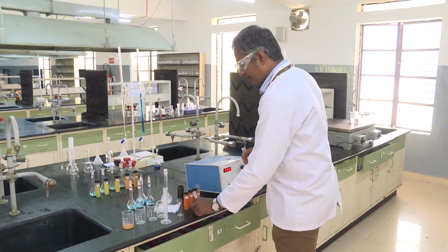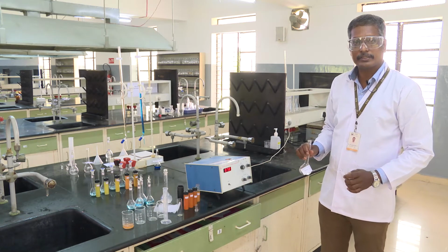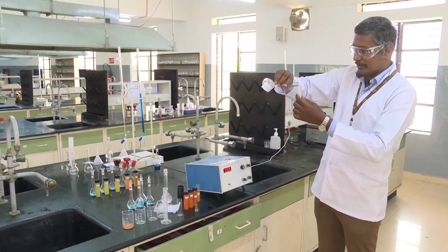The role of the conditioning agent is to keep the nanoparticles suspended, not to let them settle, and it is a mixture of glycerol and ethanol. So 10 ml of this.